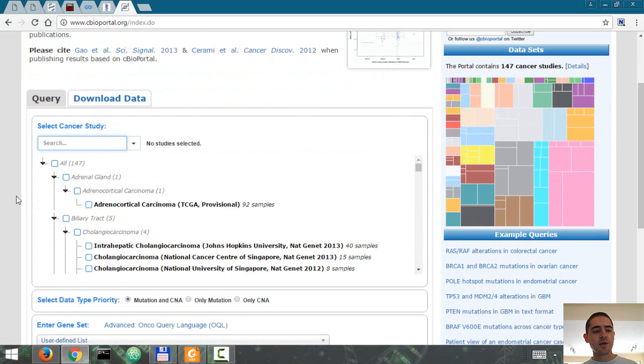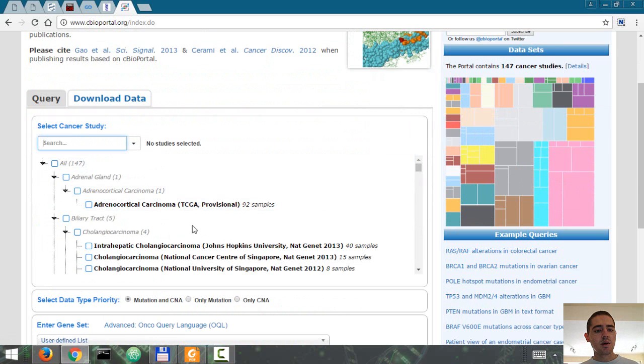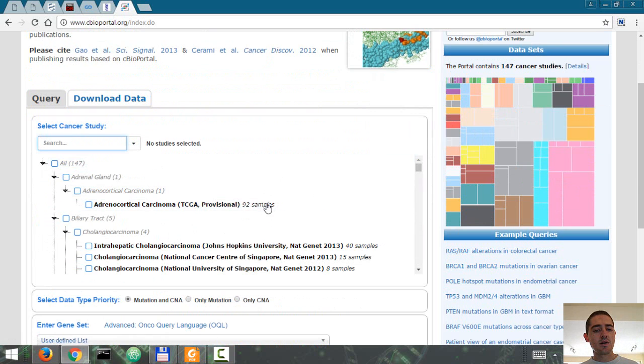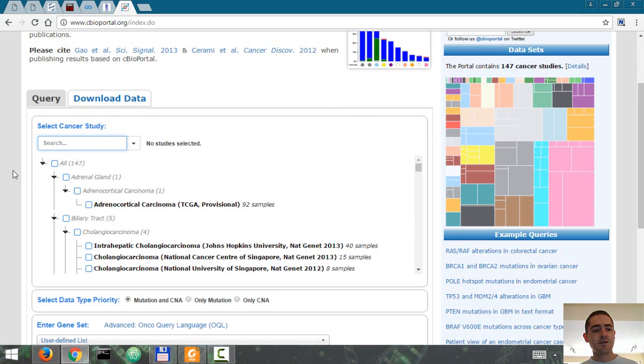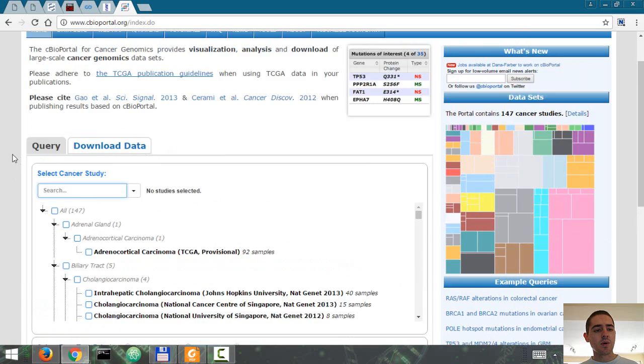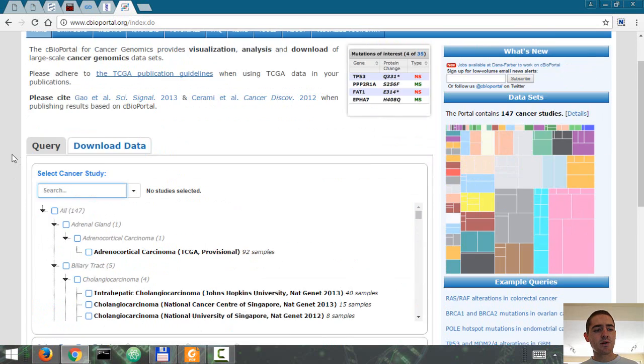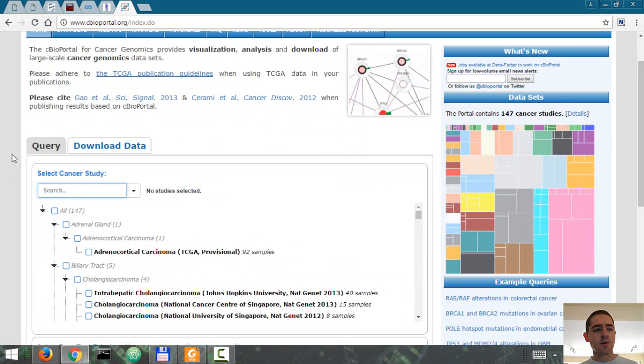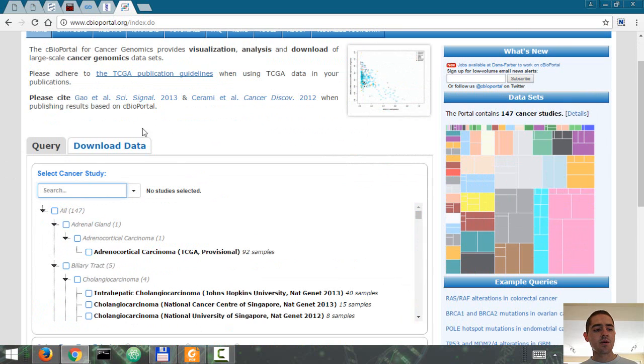So let's go through an example here. As you can see, there are currently 147 cancer genomics studies and you can download the genomics data for each one of them. We don't want to download it now. Let's say we want to see the frequency of mutation of a certain gene in a certain type of cancer.